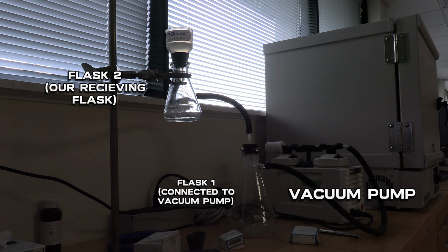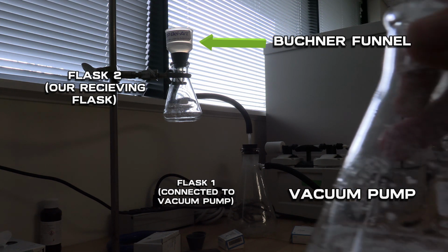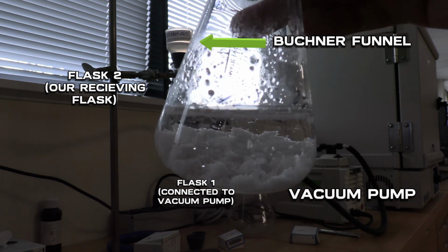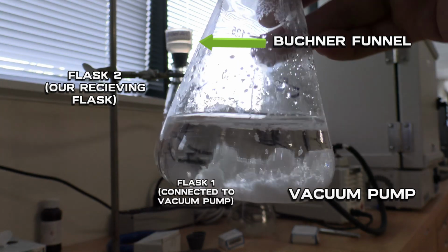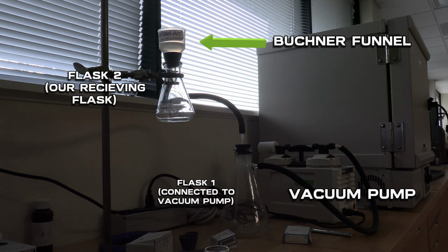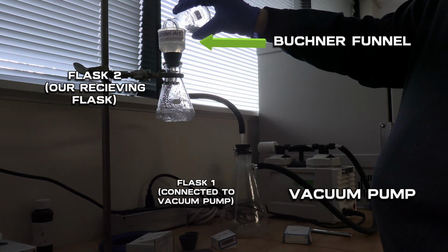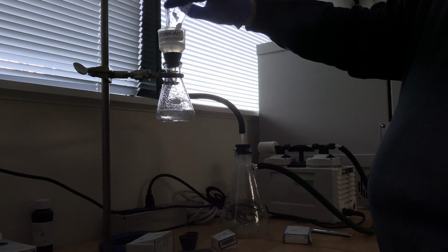The final part of the setup for vacuum filtration is the funnel where the liquid and the solid are separated. The funnel I have here is known as a Buchner funnel, and its wide opening allows me to pour large volumes of liquid and solid inside at a time. Once I turn the vacuum pump on, I can pour my flask with my crude aspirin and water into the funnel, and it will suck the water into the receiving flask, leaving just my solid.